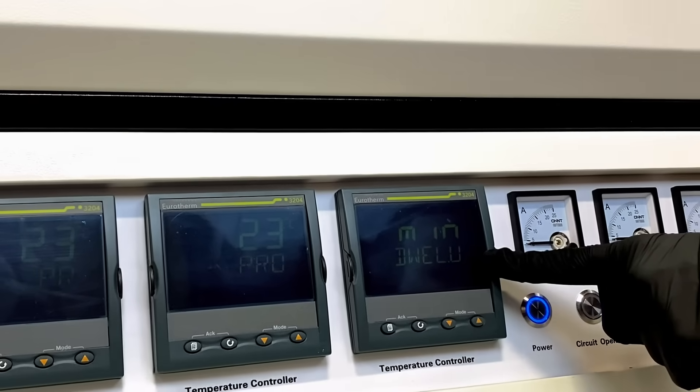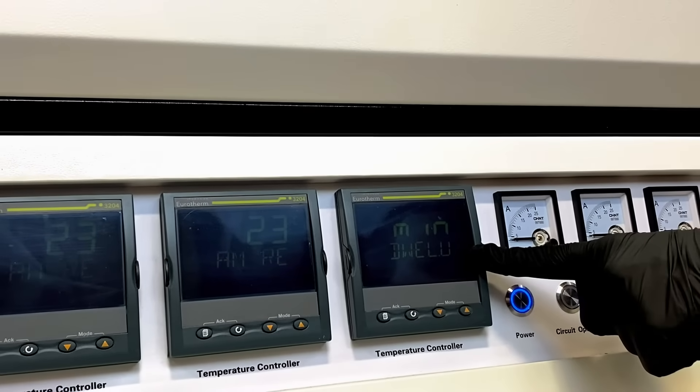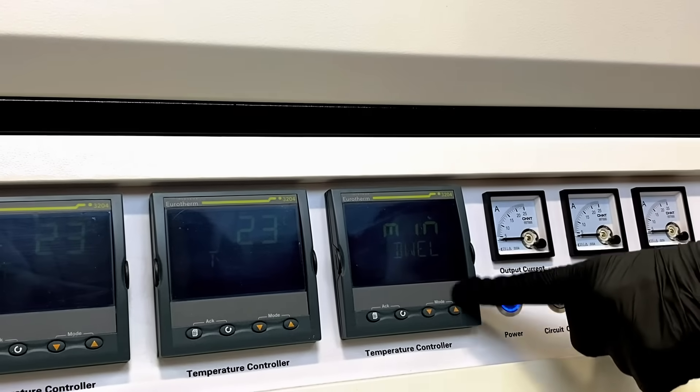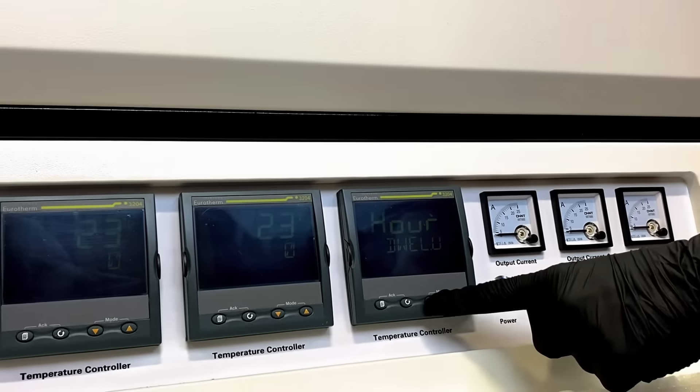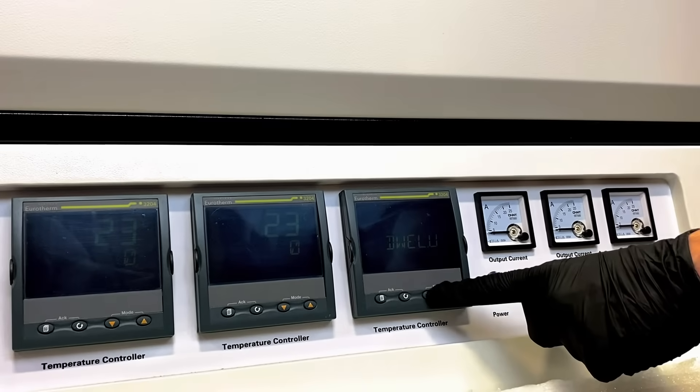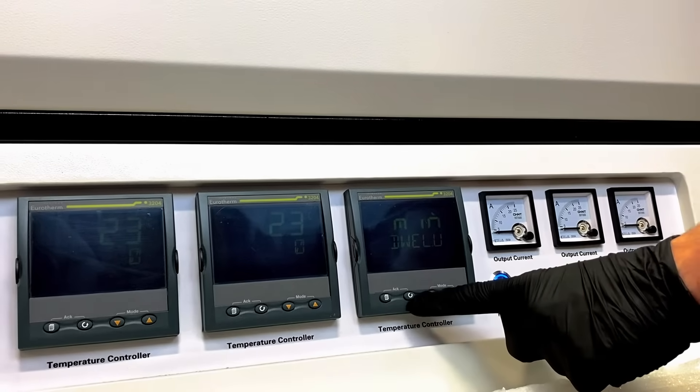Then, we will select the unit of time for our dwell cycle, or the time that our furnace will stay at target temperature. We may again cycle between minutes or hours, but we will select minutes and press the cycle button.